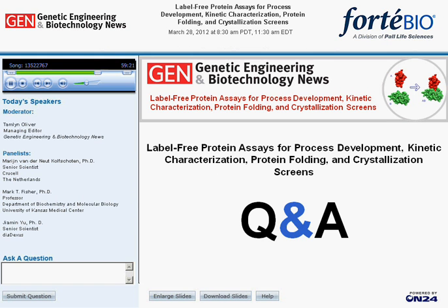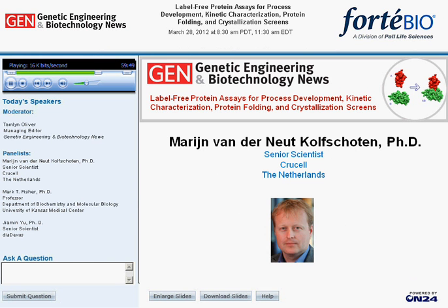Our first question is for Maren: in the kinetic fits, which model works the best or is recommended? Thank you, Tamerlan. I think that is a general question, and does not only apply to the BLI technology. In our opinion, we always try to use one-to-one fits. That means we need monovalent antigens or binding molecules used as analytes, such as Fab.